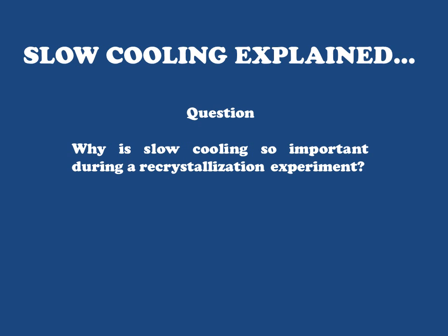And to explore this concept, we're going to ask the following question: Why is slow cooling so important during recrystallization? Why is it that if we cool quickly, we can expect our melting point data, our sample purity, everything else to be completely flawed and not acceptable?